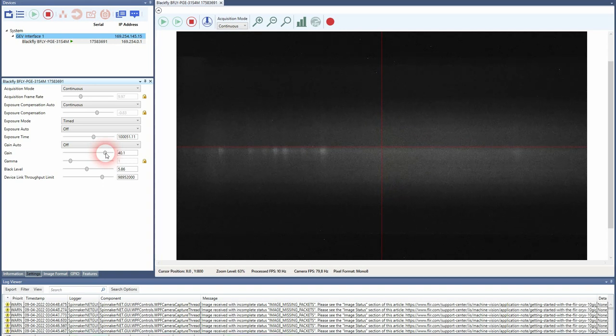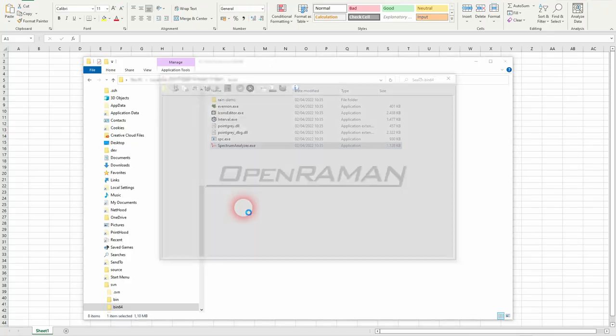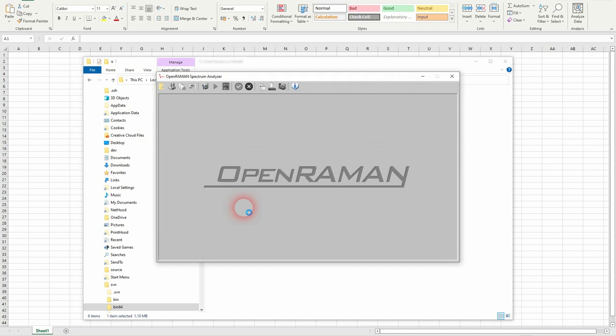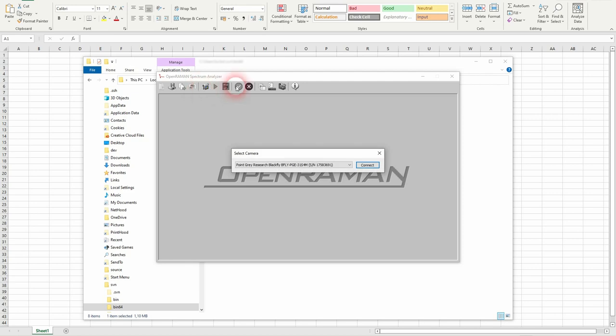And we can start the spectrum analyzer program. I will connect to the camera.